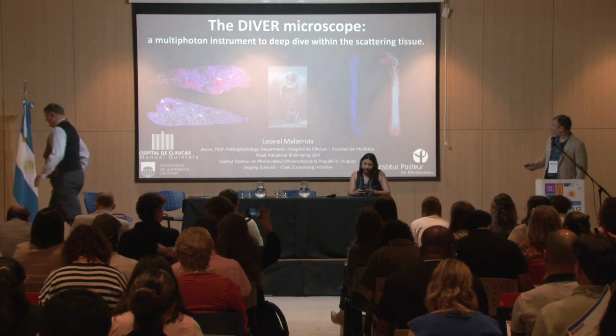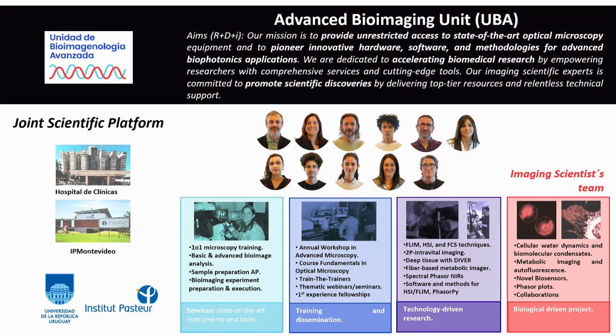Basically, this technology is aiming for deep tissue imaging and working in live samples. As Nicole said, I am the head of the Advanced Bioimaging Unit. This is a joint initiative between the Instituto Pasteur and the Universidad de la República at the Clinical Hospital in Montevideo, with the main goal of fulfilling these four claims: provide services, train, dissemination, developing technology in terms of hardware, software, and methods, blending spectroscopy and microscopy, and basically use this technology for biological questions in the lab.